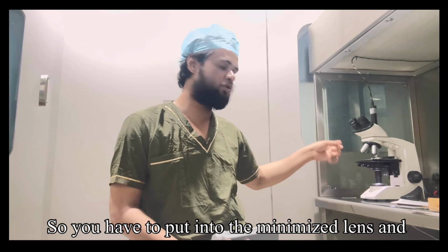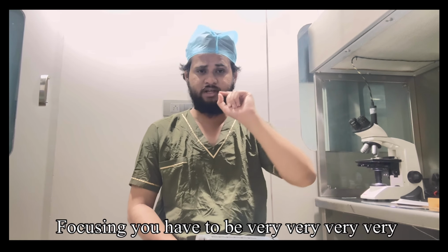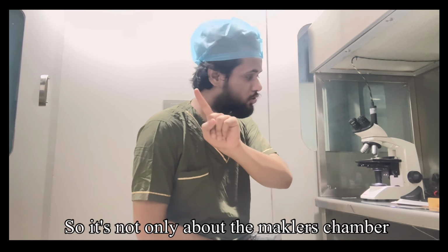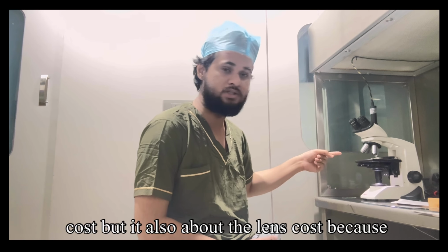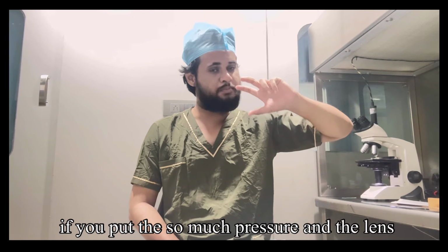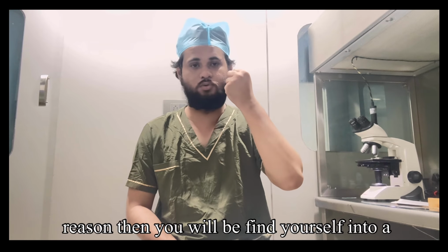You have to put it into the minimized lens, and at the time of focusing you have to be very careful, because as I have already told you, it costs 30,000. It's not only about the Makler chamber cost, but also the lens cost, because if you put so much pressure and the lens or Makler chamber breaks for any reason, you will find yourself in a lot of trouble.